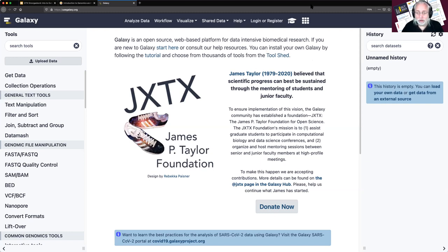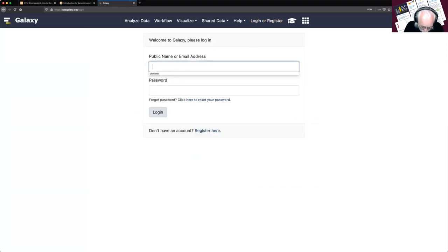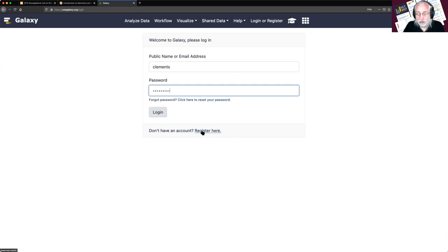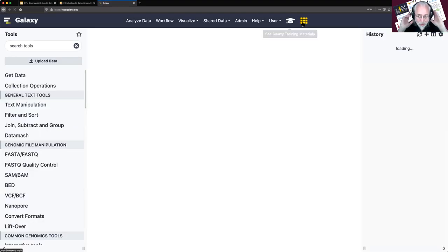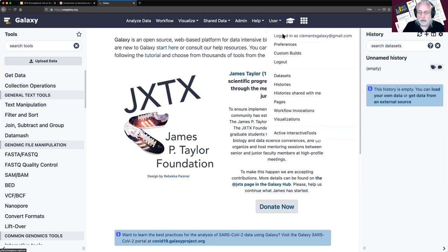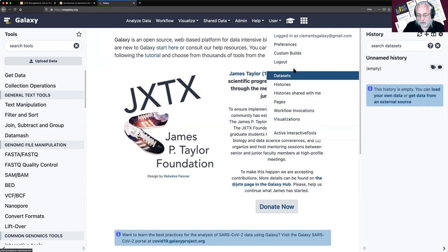The first thing we want to do is log in or register. If you don't have an account yet, you'll want to register. I have an account on this system which I will use. Click on Login or Register. If you don't have an account, you want to do the registration — it'll send you an email and you'll need to confirm your email address. Now I am logged in, and instead of saying Log In or Register, it says User.